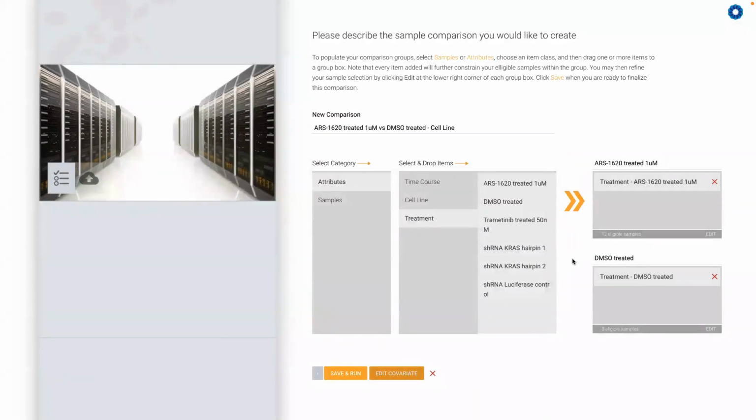And once I do that, Rosalind will put the covariate correction tag here on the end for cell line. And that will now analyze across 3 different cell lines and find the information on what the difference is in differential expression when I adjust for that confounding variable of cell line. And other cases that could be done by age or gender. So using covariate correction is a great way to gain greater insight into your experiments.